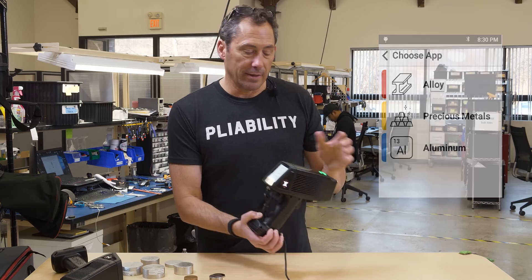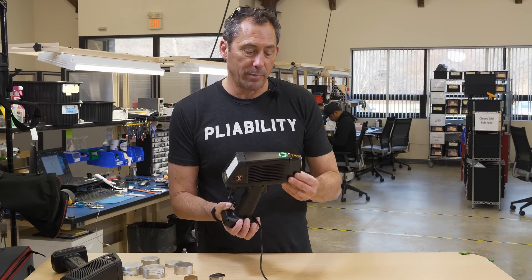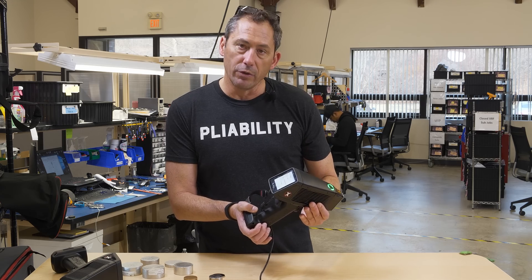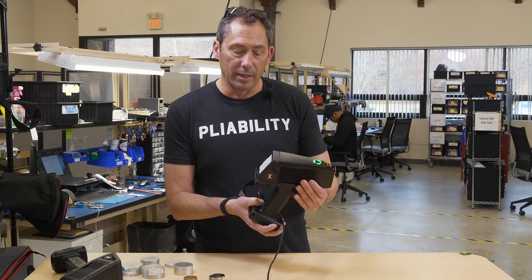That's the analyzer — purpose built for scrap. It's been a big success. A lot of recyclers are converting over from older units because of the lightweight, the speed, and the nice design.